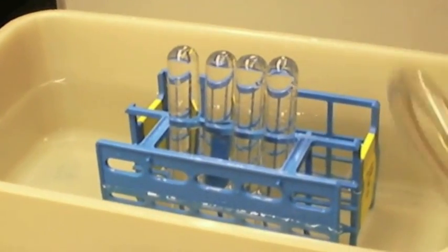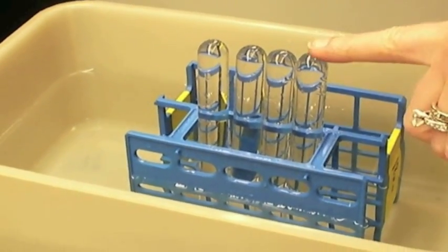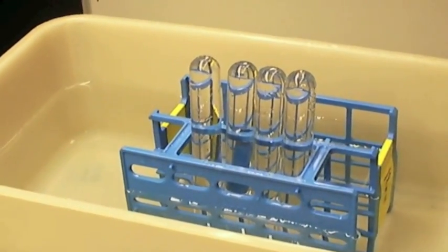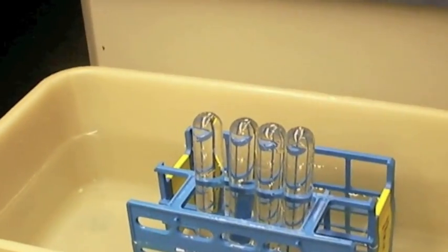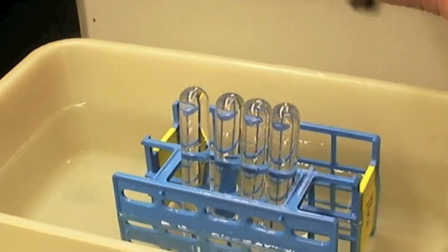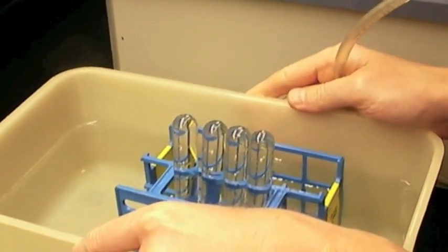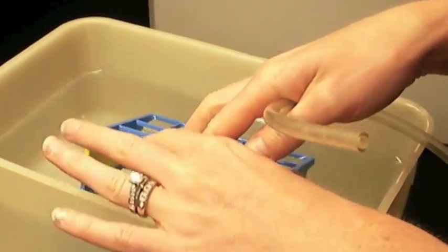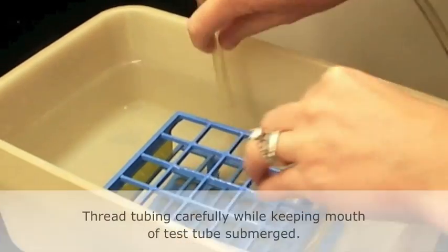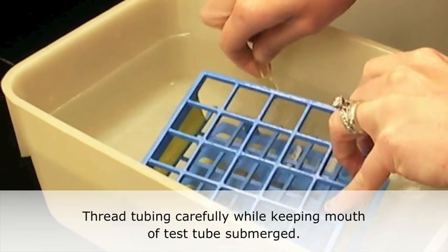Now, what we're going to do is thread the tubing through the collection tubes here, and the black stoppers are eventually going to go on the reaction tubes, but we don't need to worry about those for right now. In order to do this, I might turn my test tubes back on their side, keeping them submerged so I don't lose any of the water. And I'm going to snake the tubing up into the test tube.